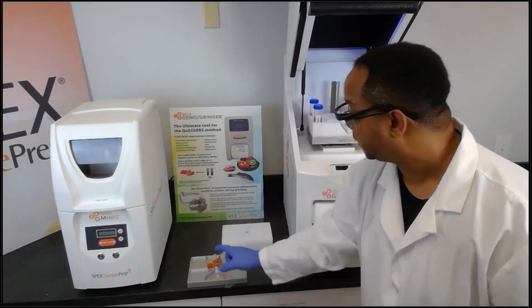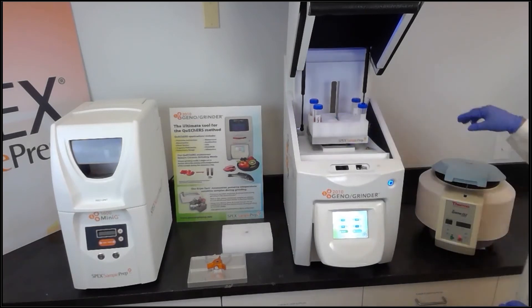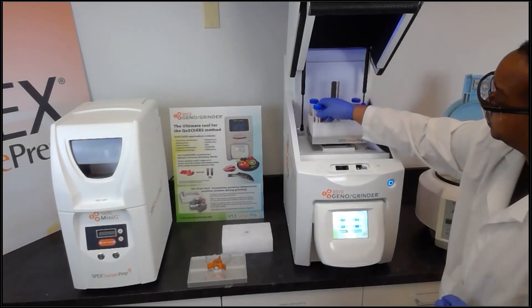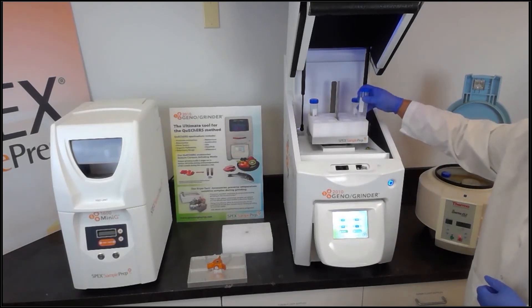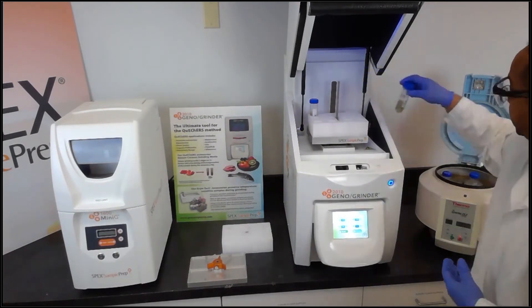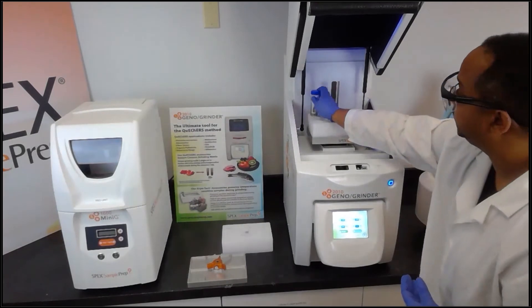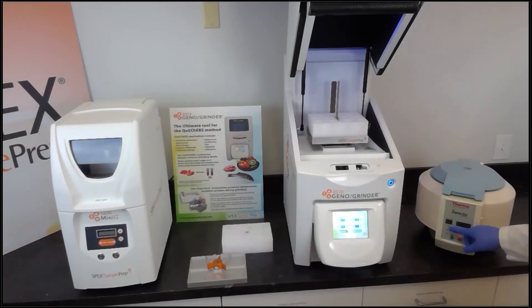After samples have been homogenized in the GenoGrinder, you want to place them in a centrifuge. The centrifuge is designed to separate the solid phase layer from the liquid layer. We simply add the tubes to the centrifuge, close the lid, set the speed to 3500 RPMs, set the time for three minutes, and then press start.